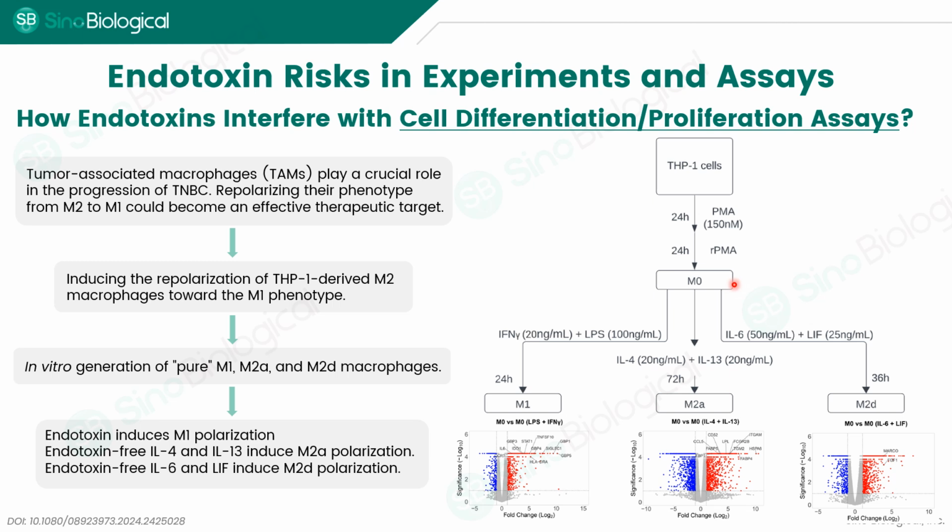When you want to add LPS in your specific experiment, you may need to avoid endotoxin being brought in from any other reagent.